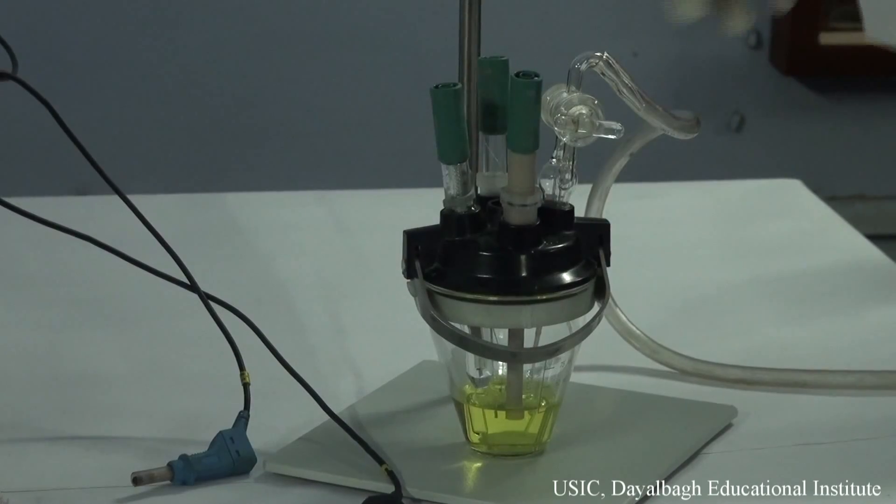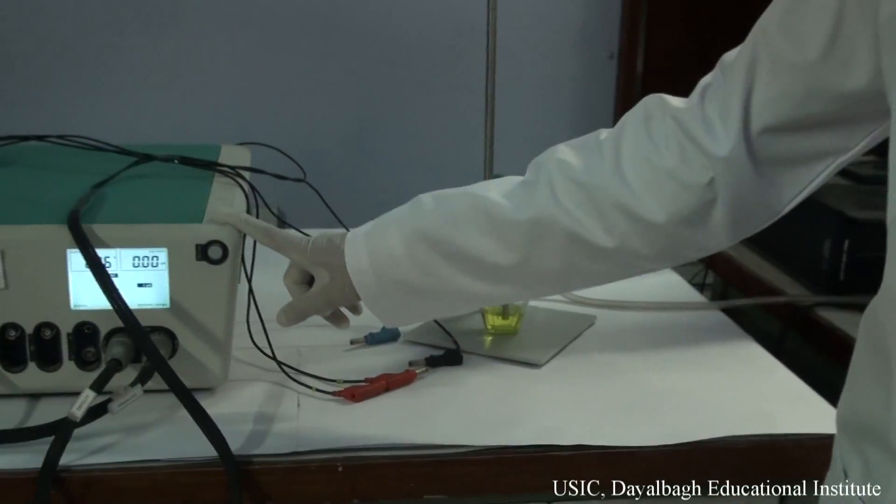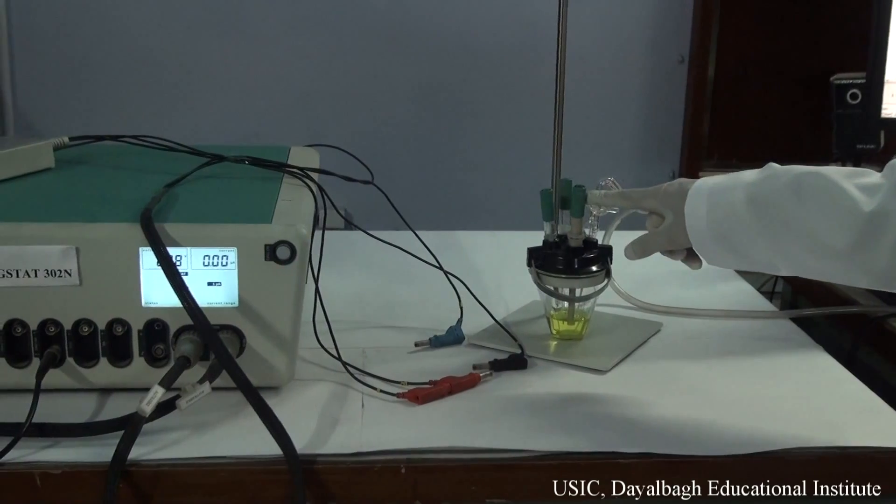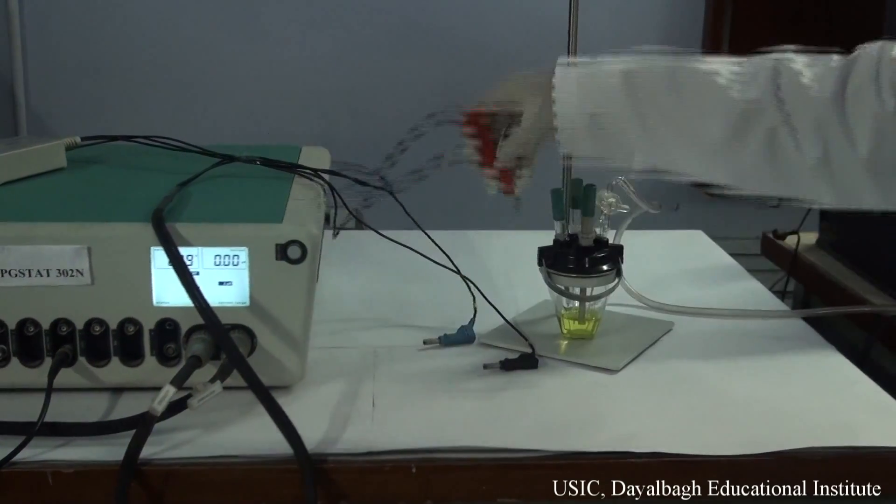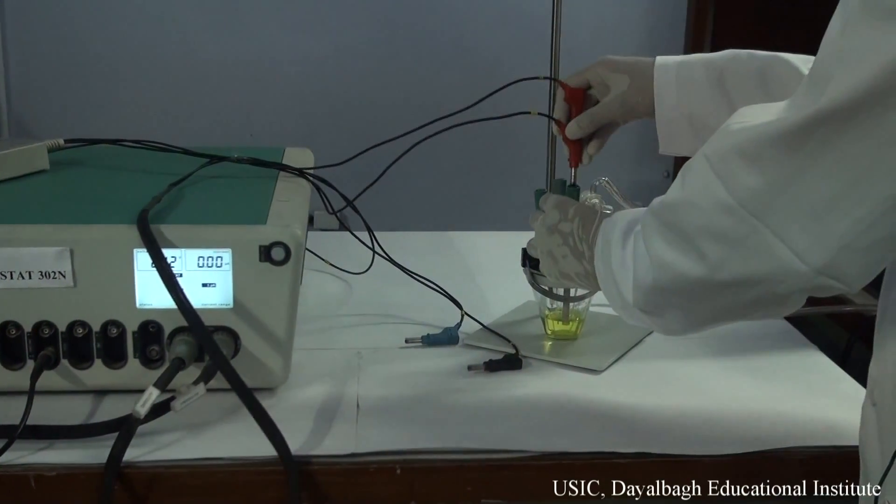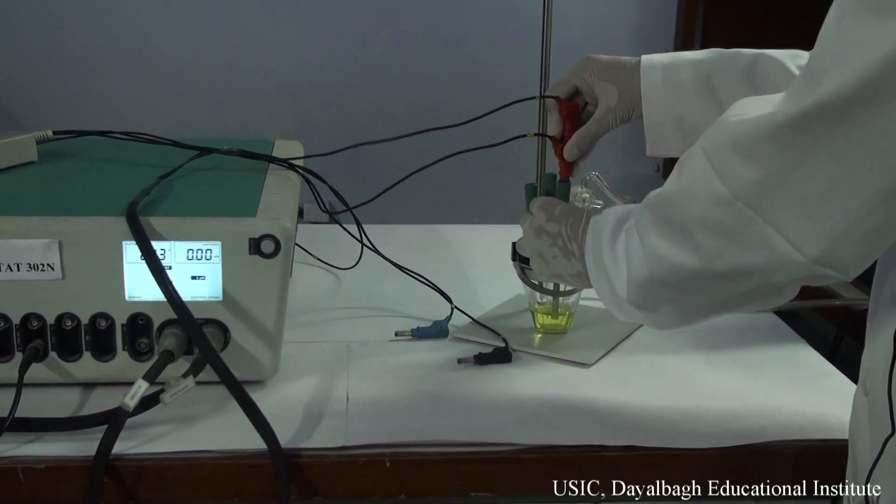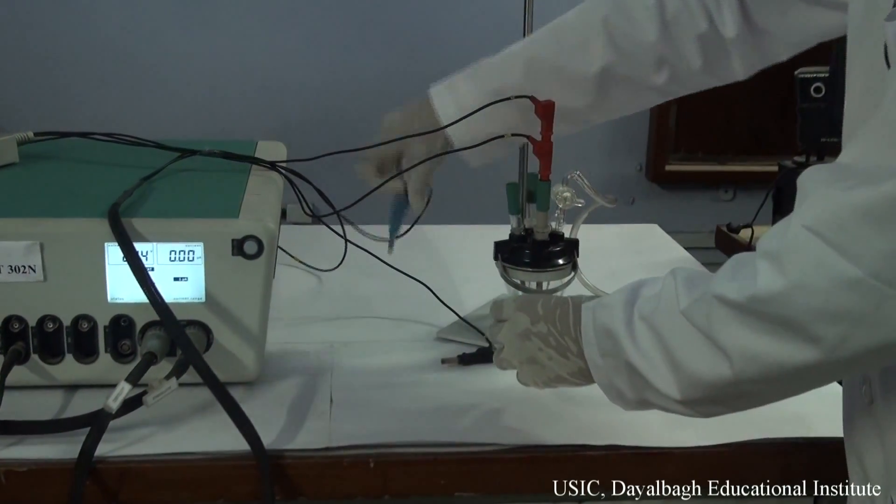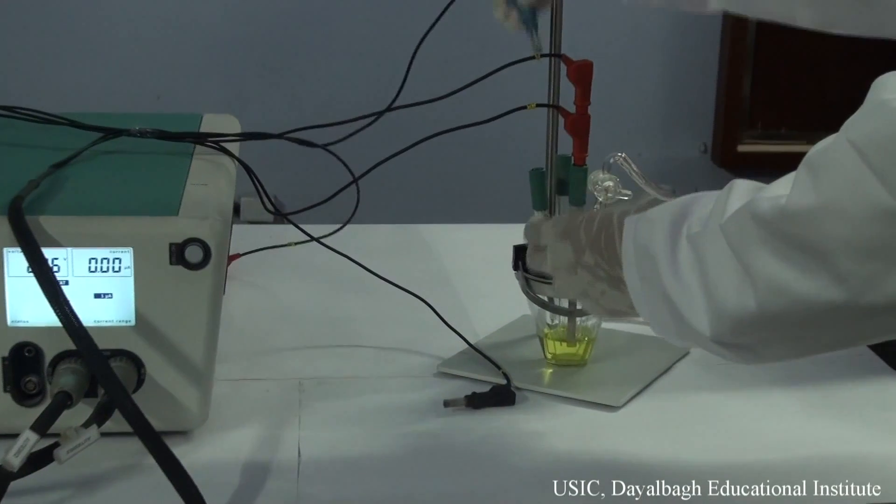Now we will make connections of the Autolab PG-Stat 302N with this electrode system. This is the working electrode. This blue one is for the reference electrode.